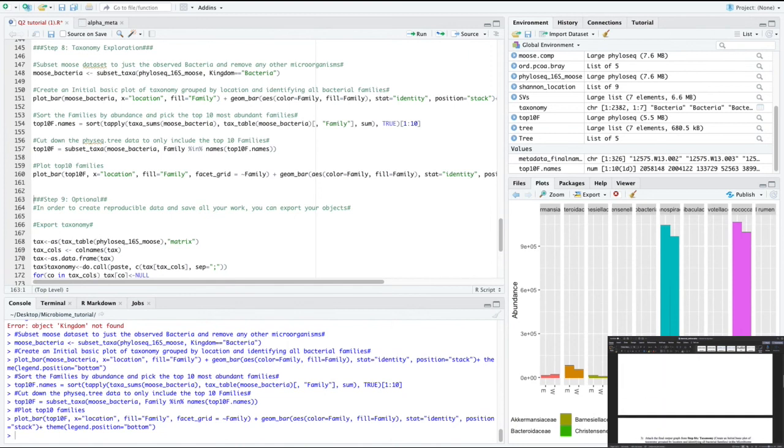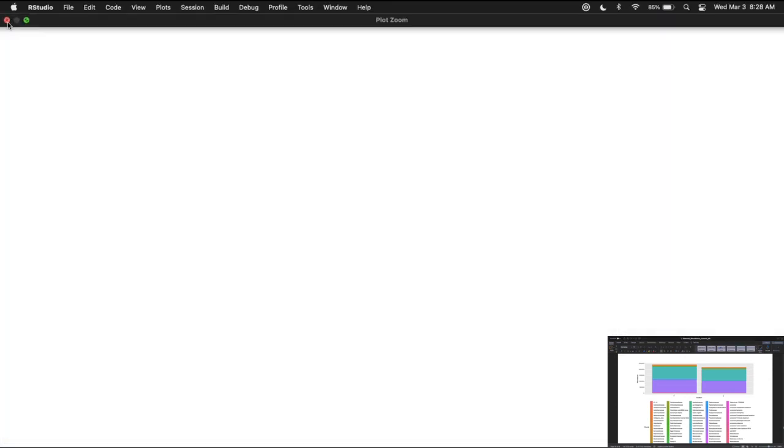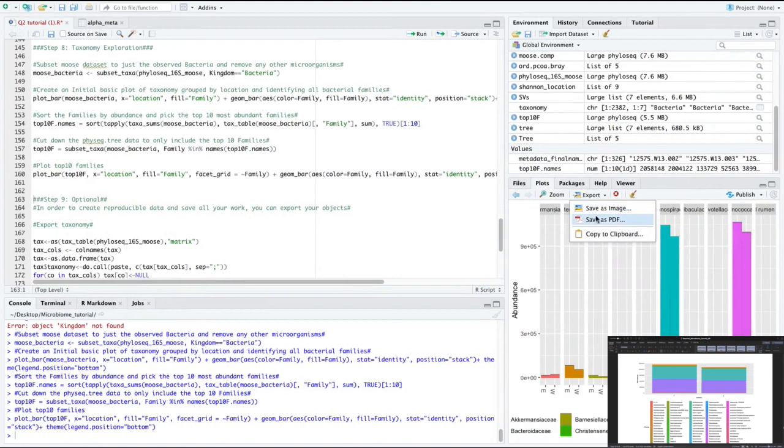So overall, it's like 6 questions. Honestly, if you're following the tutorial pretty diligently and reading, it shouldn't be super hard. It just might take you a while to work out kinks, you know, make sure you're not making spelling mistakes and stuff. And then, like I said, these graphs take a little bit to load, so when they finally do load, I would just do export as PDF and then save it as like an 11x4, because there's just no time to go back and do them.